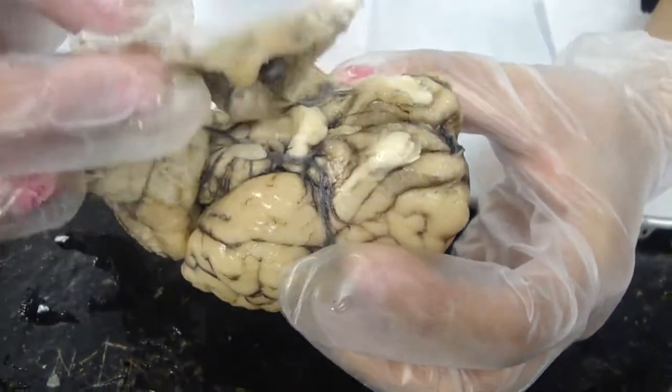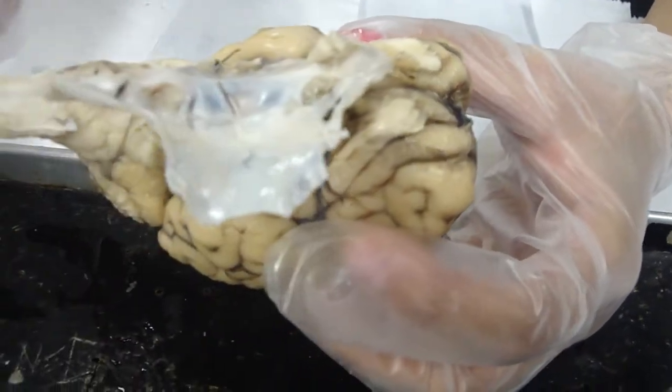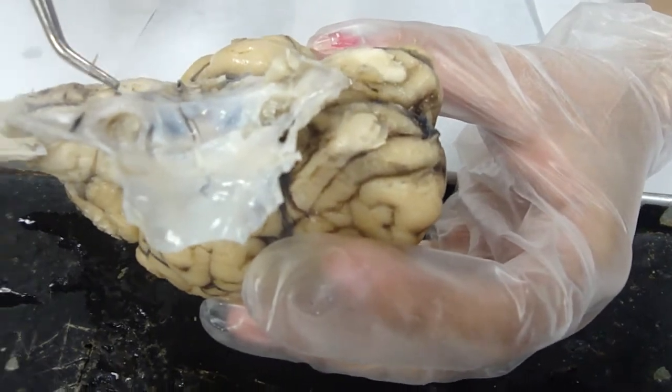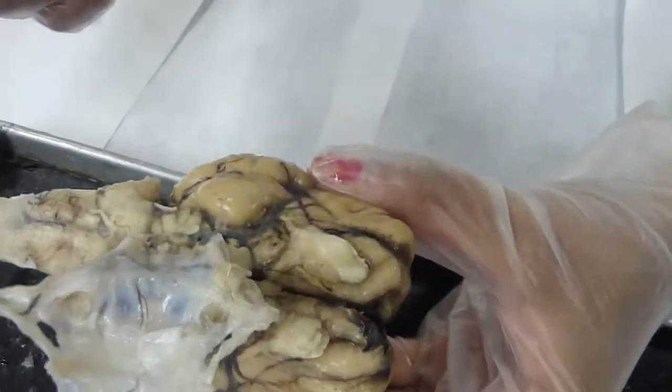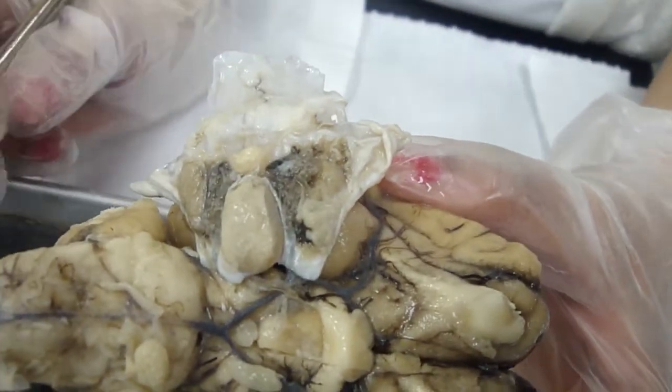With the membrane still intact around it on the inferior view, this is this large structure you're going to see here. The pituitary gland. In order to see the cranial nerves, which is going to be our next step, we're going to have to remove this entire piece of membrane along with the pituitary gland so that we can get down and look at those cranial nerves. If you haven't done that already, then you'll need to do that.